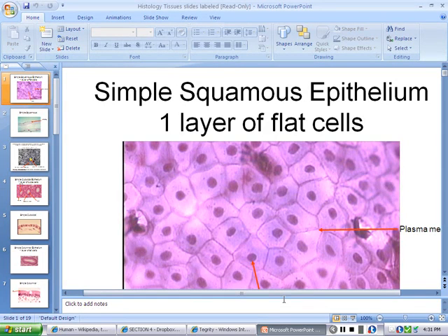talked about. If you've looked at pictures of epithelial tissue or connective tissue in previous lectures by the other instructors, I'm going to be pulling some pictures from all the PowerPoints, and that's going to be kind of your lab part of this exam. So I'm going to talk you through the different types of tissues and what they look like and what to look for, and hopefully this will help you understand what they look like histologically. Remember, histology is basically the study of the tissues using a microscope, seeing their component parts.